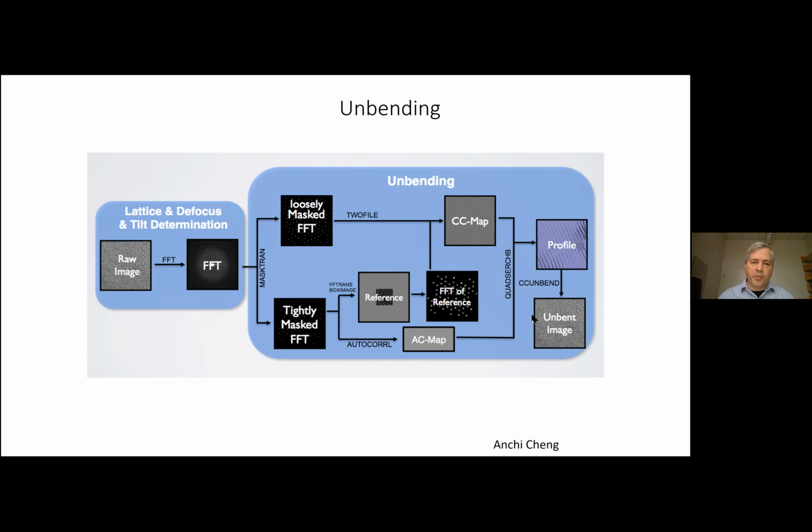There used to be a whole bunch of individual programs that you would have to run individually to do all of this. Eventually there was a nice 2DX graphical program, by I think Holger Stark's lab, that made a GUI for it, which made it a lot easier, but it was still more difficult, I would say, than single particle.